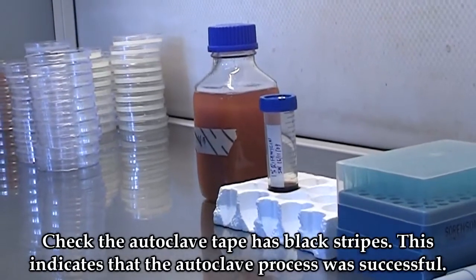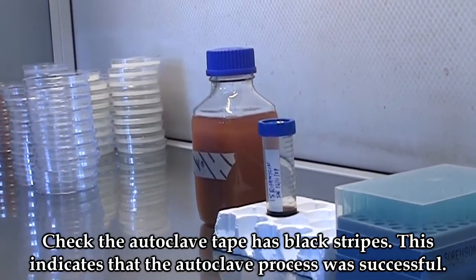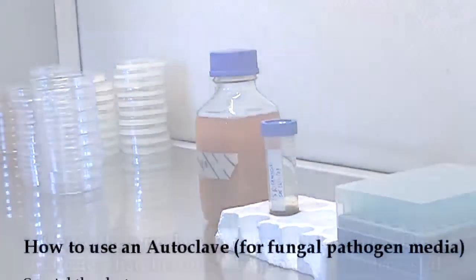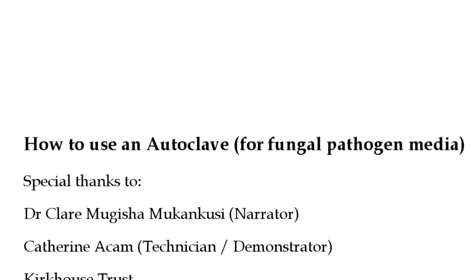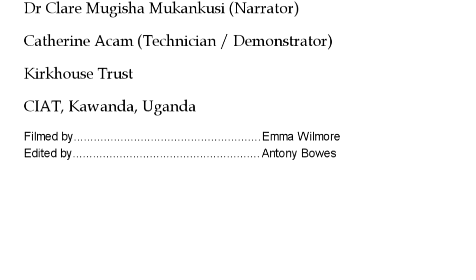Check the autoclave tape to ensure it has black strips, implying that the autoclave process was successful.